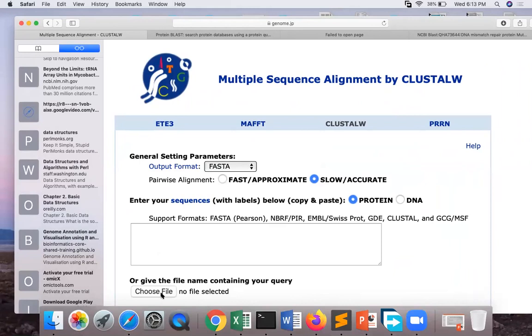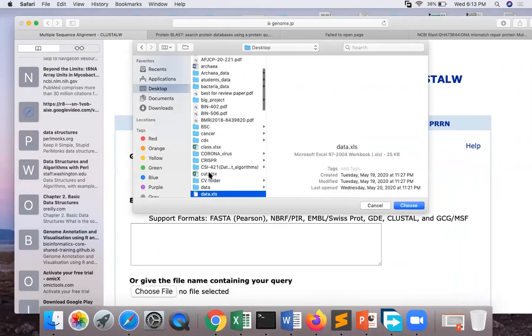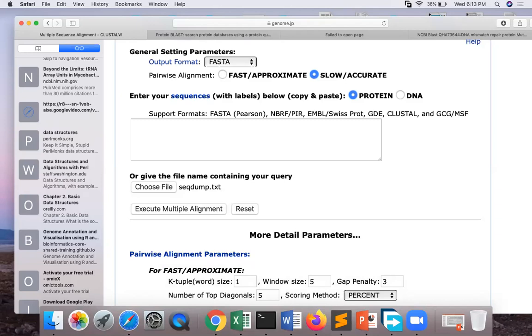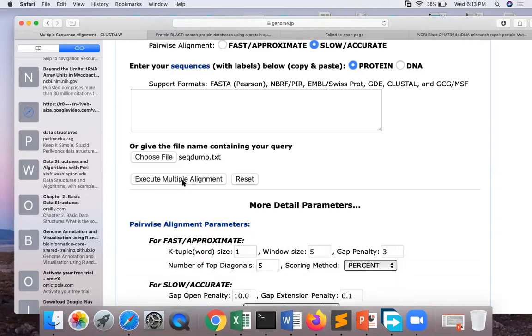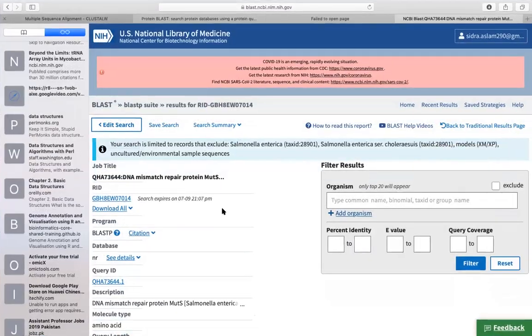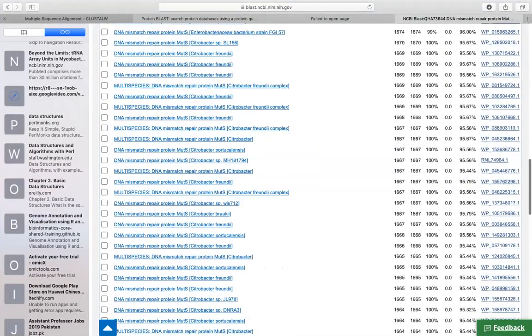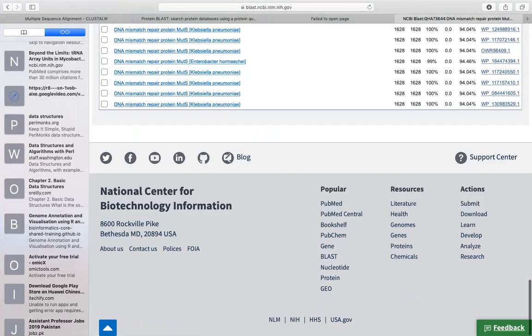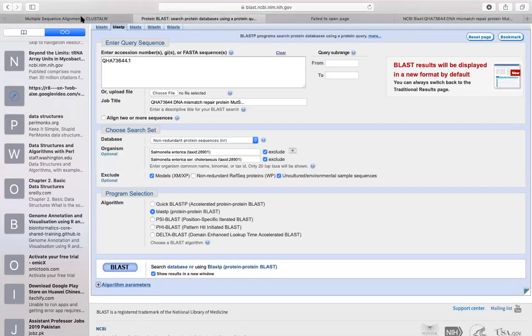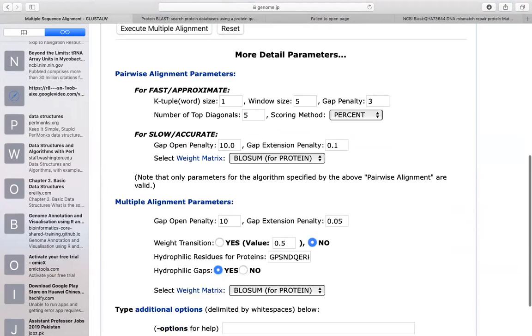Now we can enter the file in ClustalW. Just choose the file — the SeqDump file. Now we have the file. We will execute multiple alignment here. I hope you understand how we retrieved this BLAST data. I was thinking this is a shortcut: if I had given you 10 species for multiple alignment, you would have to go into the protein database, find each species one by one. Due to shortage of time, I have selected just three or four. You can run this on your own for more sequences. Now look below at the parameters and algorithm settings.